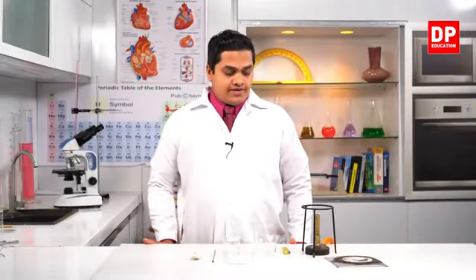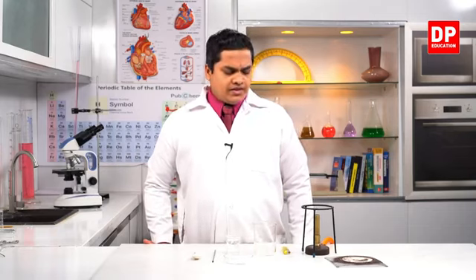Right, my dear children, now we are about to investigate another experiment. In this experiment, I'm going to use some salt and dissolve it in water, and by heating, I'm going to evaporate all the water in it. By that way, I'm going to observe whether this change occurring inside the salt solution is a chemical change or a physical change.